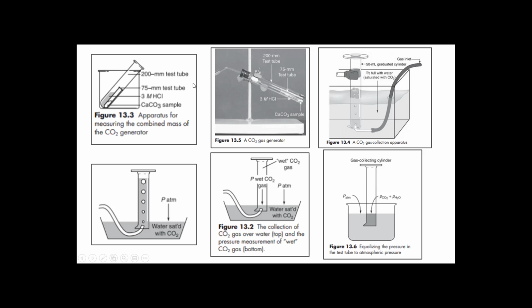So what happens is that when you shake this, it's going to force the CO2. The CO2 is going to come through here and push out the water. And that's what you see in this picture here, is that this is going to go through water. This is why you saturate the outside water with Alka-Seltzer, because the water can take up CO2, which you do not want. You want your reaction to be completely accounted for. So you saturate the water with Alka-Seltzer to prevent any more CO2 being taken in by the water.